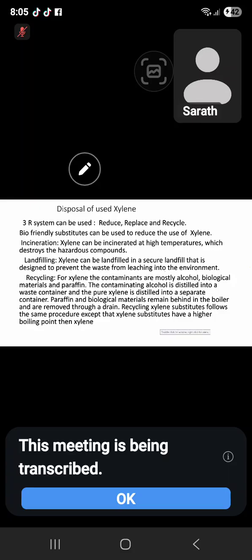Reduce the xylene use, reduce the alcohol use, reduce the formalin use, and replace it. You can use some other substitute. Instead of xylene, you can use toluene, benzene, like that. And recycle. You can use recycle machines. Recycle machines are commercially available. You can purchase them, and by recycling you can obtain 99.9% xylene from the used one. So these are the things: you have to apply the 3R system, reduce, replace, and recycle.